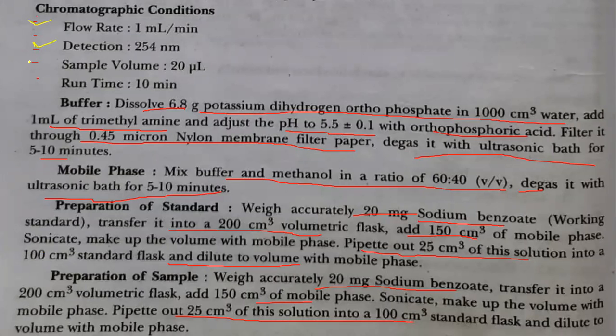Then the detection is carried out at 254 nanometer. Sample volume will be 20 microliter while injecting into the system. Run time will be 10 minutes. Okay, so we have to prepare the buffer first, and then we have to prepare the mobile phase. Then we are preparing the standard, and then we are preparing the sample solution.